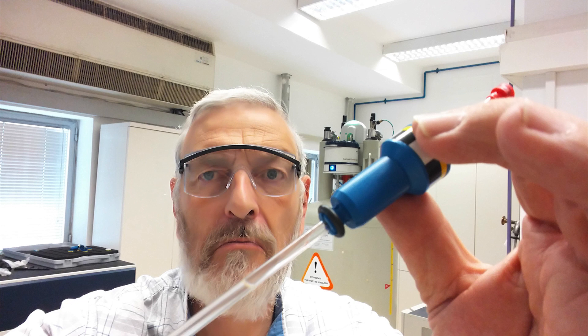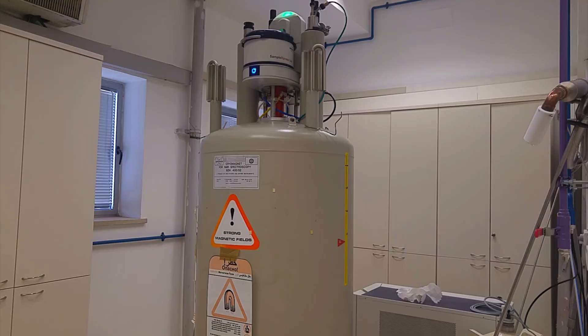The samples would not spin. This is a sign of dirt on the turbine or in the probe. This happens every few months, so it is time to clean out the magnet more. Sometimes this problem is accompanied by changed and unstable shimming, indicating loose dirt.